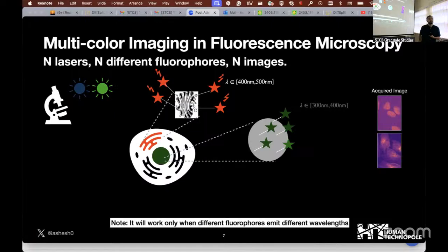Several of us are from CS theory. So what's a fluorophore, and what do you mean by when you throw light on it, what happens? Okay, I will be brief in my answer. A fluorophore is a class of chemical compounds which has the property that when you shine light of specific wavelengths, they get excited and emit photons of specific wavelengths.